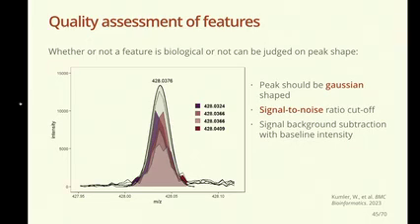So then, of course, from a chemometric perspective, interesting biomarkers, interesting features that occur after the modeling will be the first focus to look at more in depth.